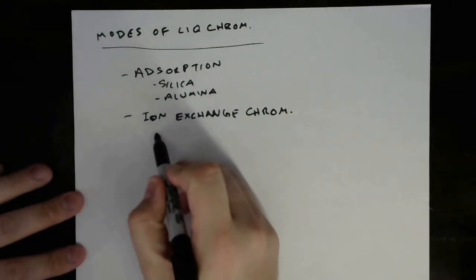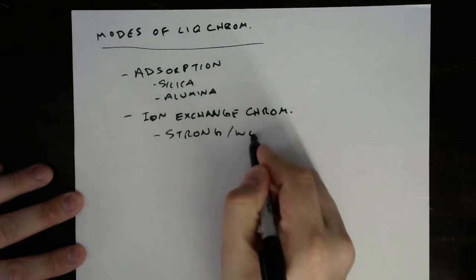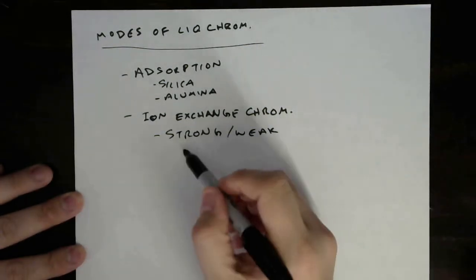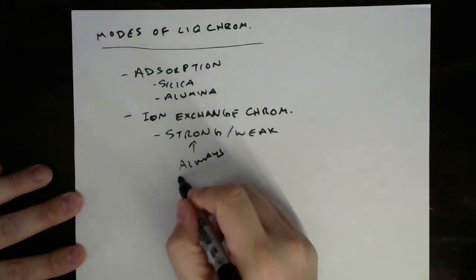We put this into two categories. We talked about strong versus weak ion exchangers, where the difference was that strong ion exchangers always have charge.